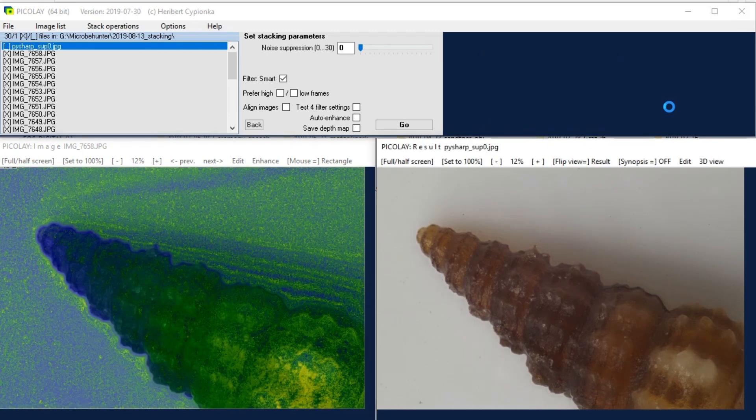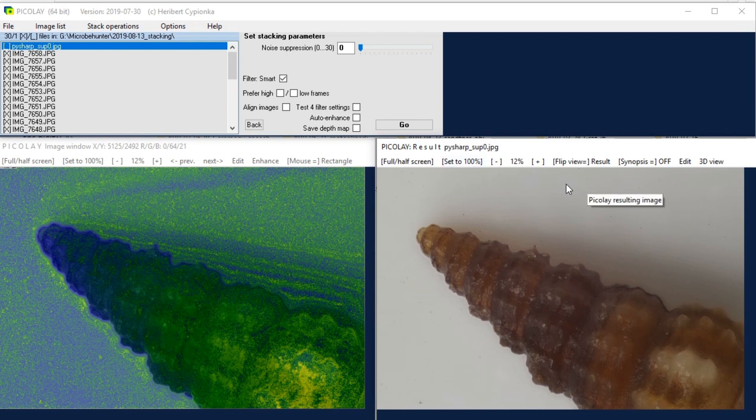The stacked final image is then saved in the same subdirectory of the original images and on the left side you can see the so-called depth map and this means that you can see the different colors the blue parts are all those parts that are further back and on the right side you can see the stacked image and this one is automatically saved.